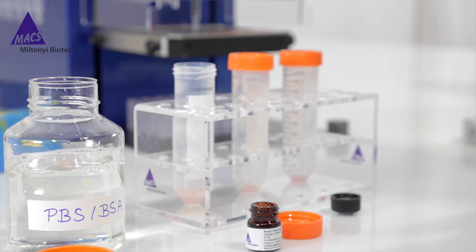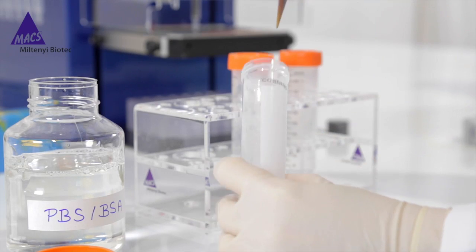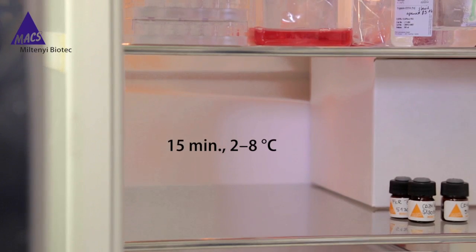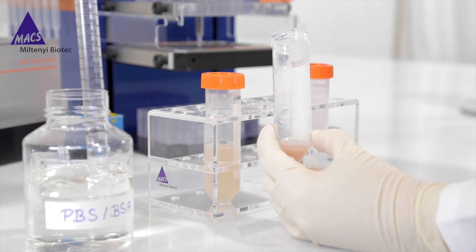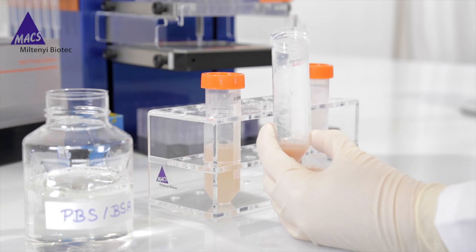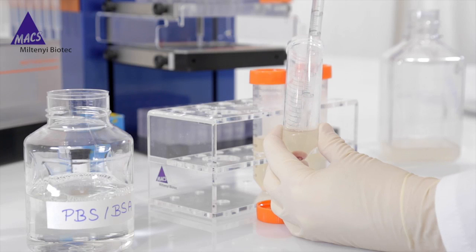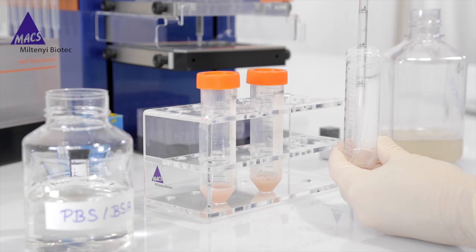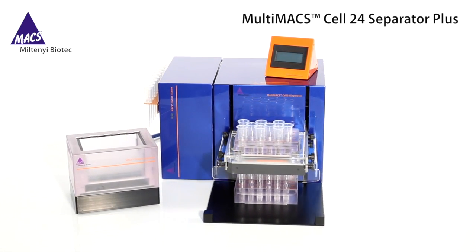These maximum volumes can also be used for human tissue. Mix well and do not vortex. Incubate for 15 minutes in the refrigerator at 2 to 8 degrees Celsius. Wash cells by adding 10 times the labeling volume of buffer — so here 20 milliliters — and centrifuge at 300 G for 10 minutes. Aspirate the supernatant completely. Resuspend pellet in 3 milliliters of PB buffer. Now comes the depletion step for the myelin debris, and for this step we use the MultiMACS Cell 24 Separator Plus, which is capable of processing up to 24 samples in parallel.